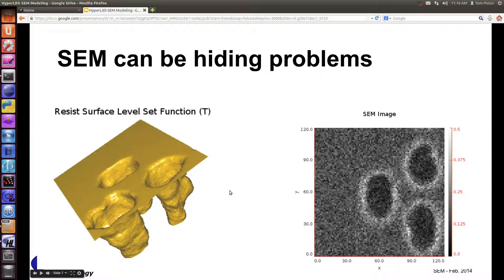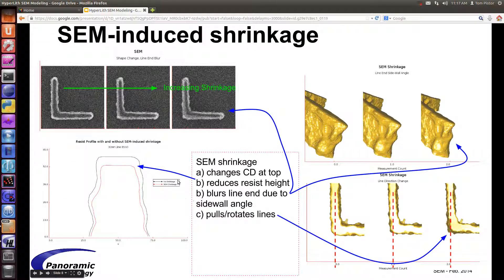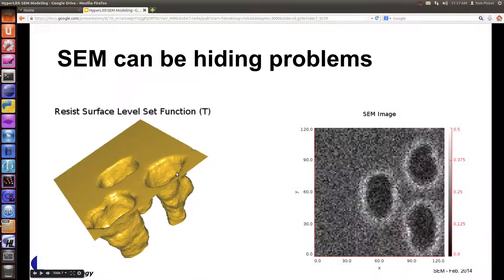Another thing about the SEM is that sometimes it can hide a problem that the resist simulation would show, and vice versa. Here, this contact is not going all the way through, but it's not really evident on the SEM. So if you're doing resist calibration and measuring these contacts, it may not be valid because the SEM is showing you the top.